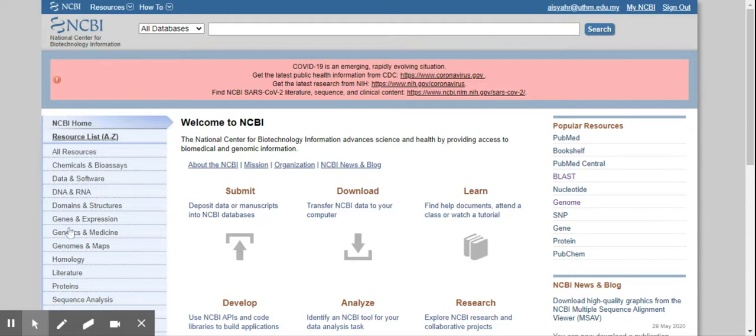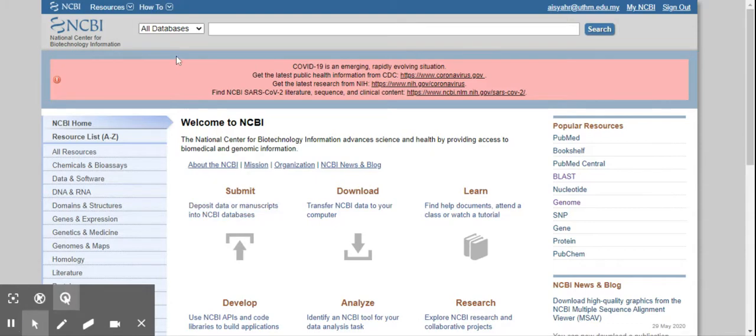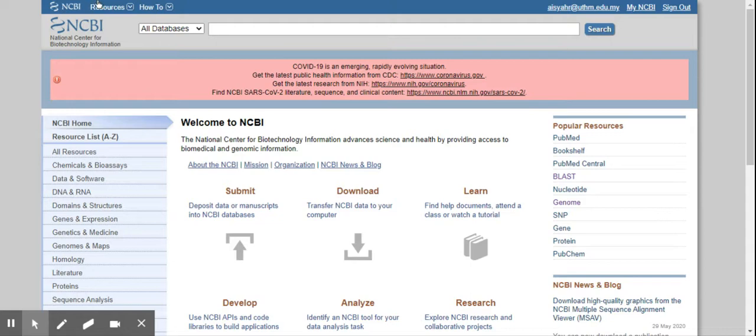You can go to the NCBI website, ncbi.nlm.nih.gov, or you can Google. Let me start from Google.